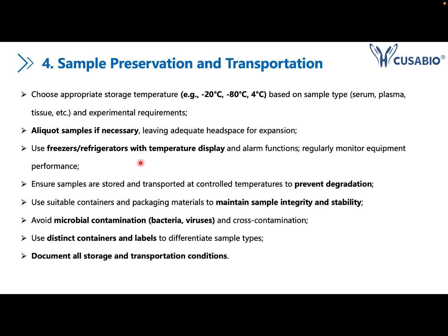For the freezer and the refrigerators, we recommend the instrument having the temperature display and alarm functions because with this, you can regularly monitor the equipment performance. And also degradation is another thing.